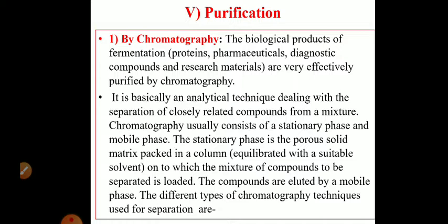Purification of the product can be done by chromatography. It can be done by crystallization. It can be done by dialysis or electrodialysis. It can also be done by distillation. So now let us discuss the first and most commonly practiced method of purification, that is chromatography.